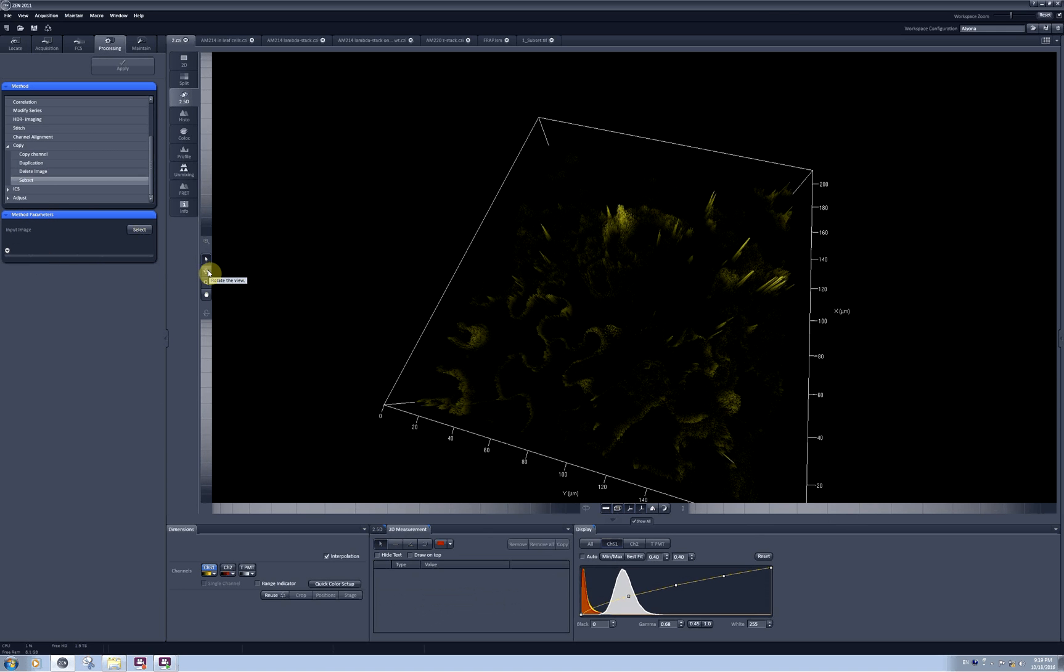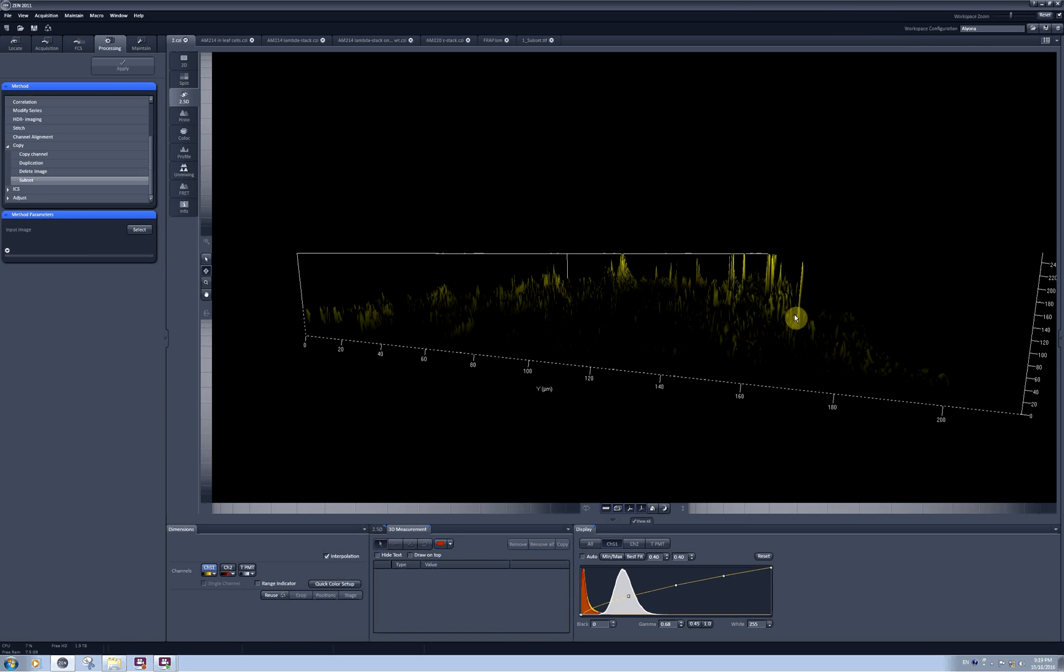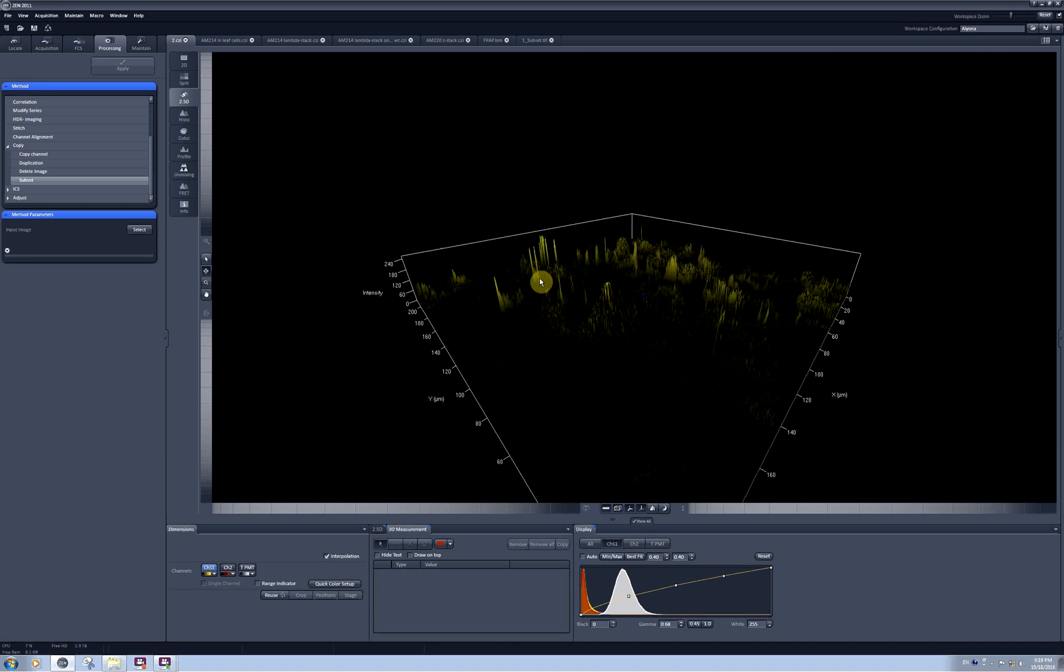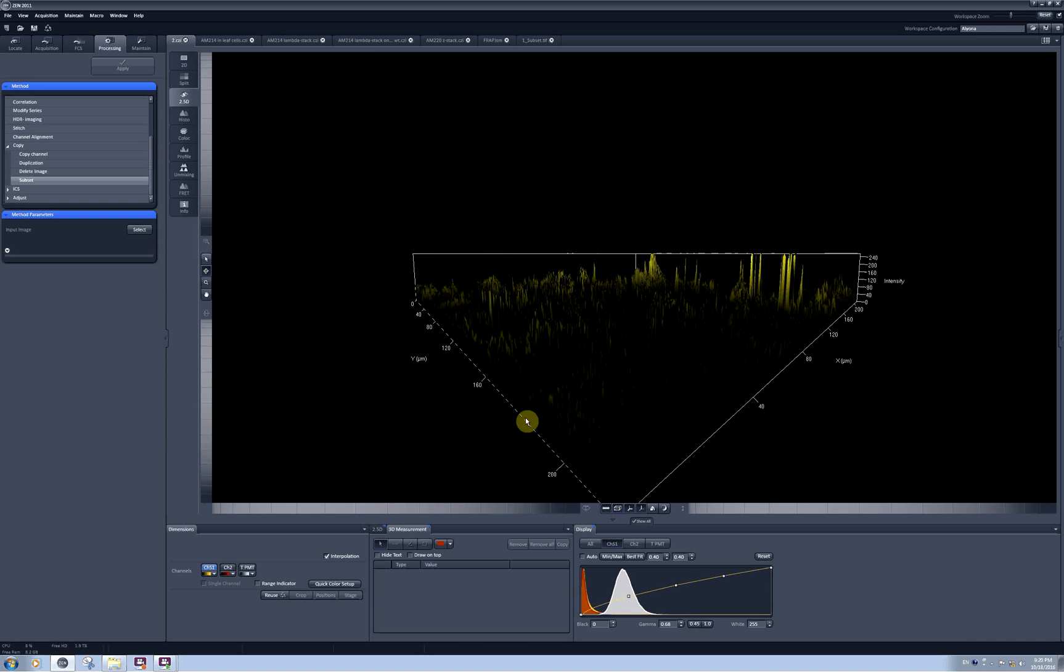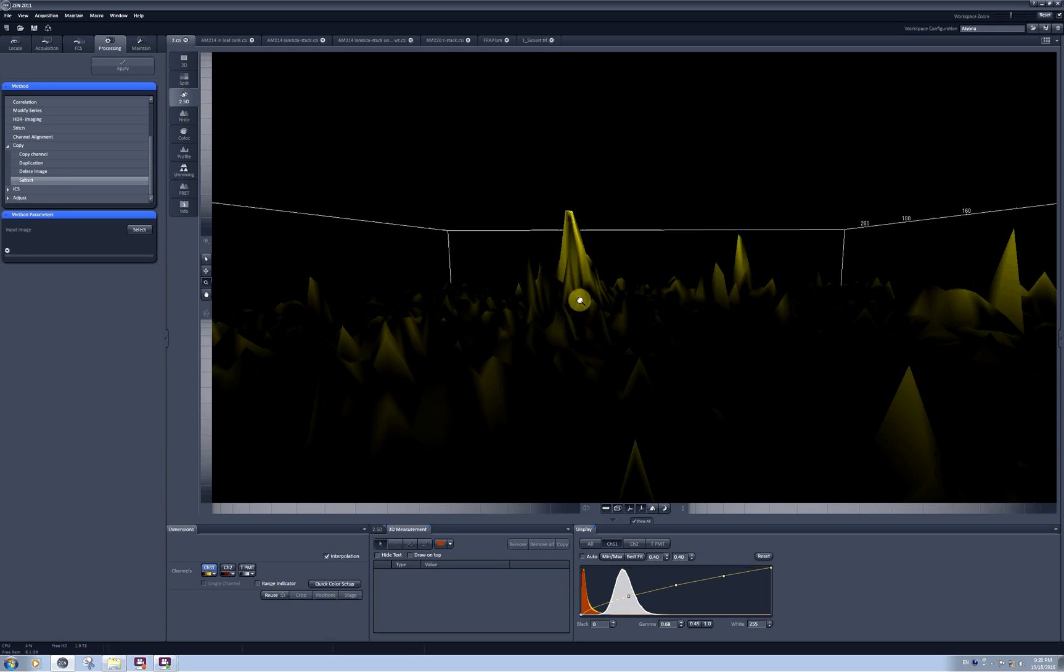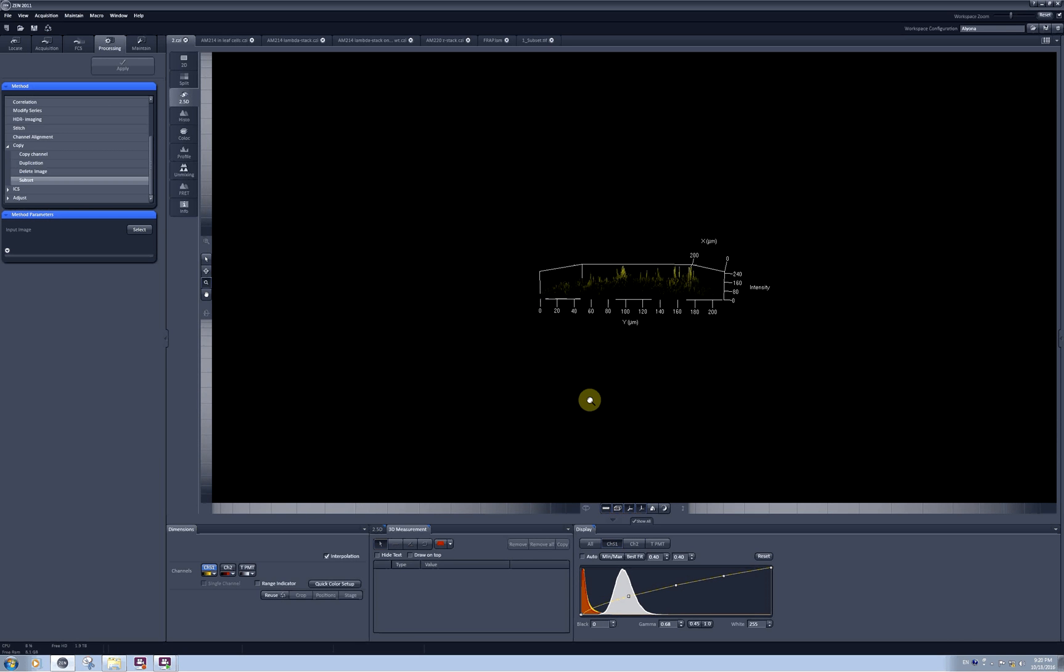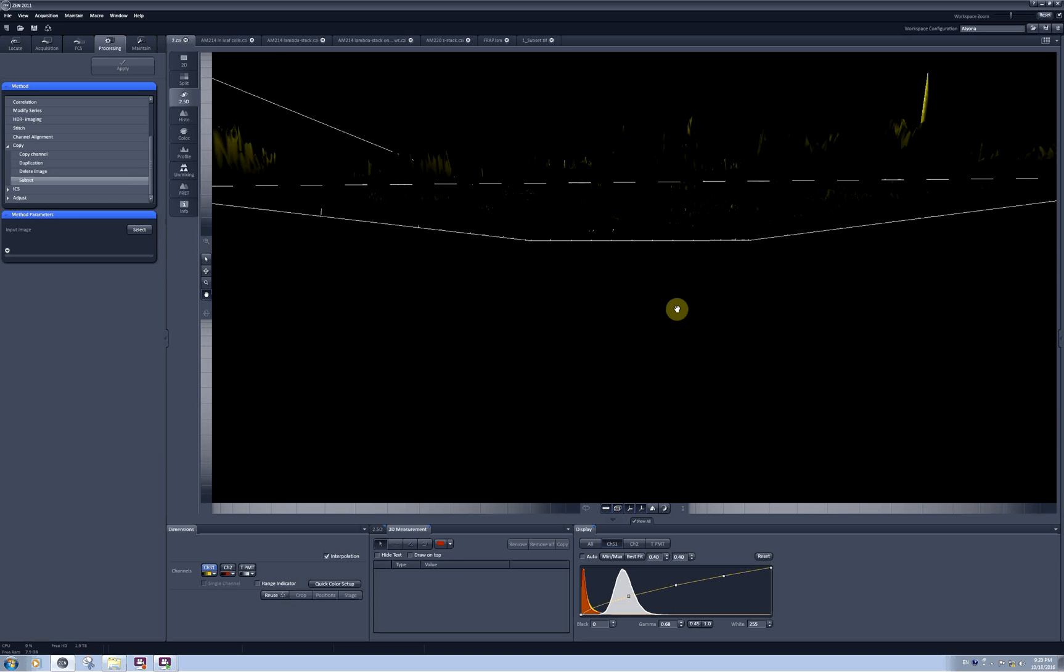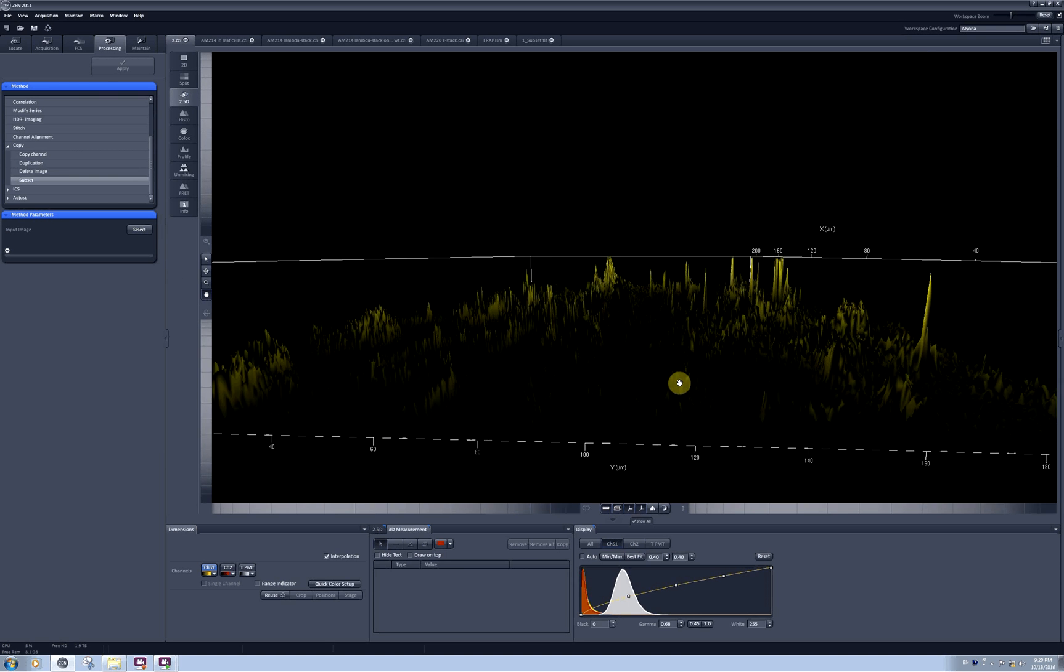This tool rotate the view is quite useful. It allows you to level it in the xy plane and then rotate around the z-axis so you can look around at your intensities. And the next tool allows you to zoom in and out by moving the mouse towards yourself or away from yourself. And this tool allows you to lift or lower down your model along the intensity axis or z-axis.